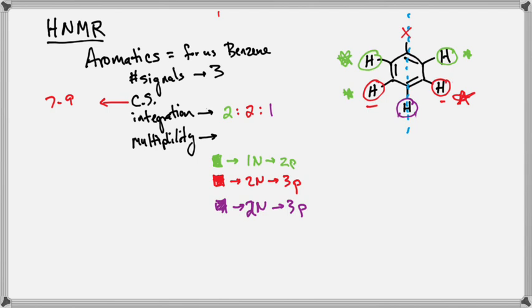Ever. 1, period. Look at the purple hydrogen. It's going to see 2. That's a single hydrogen branching out to see 2 red hydrogens. For the green, it's only looking down and only seeing 1 on both sides. Even though they're the same chemically? The red?